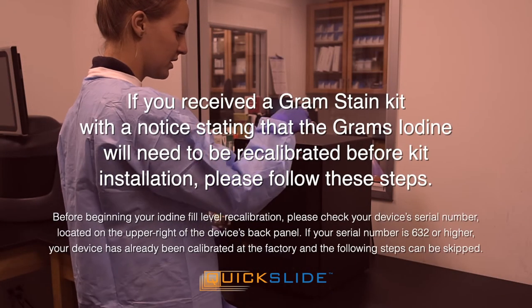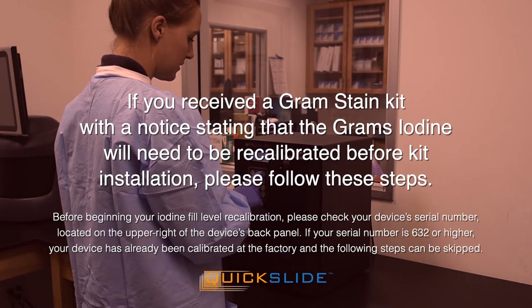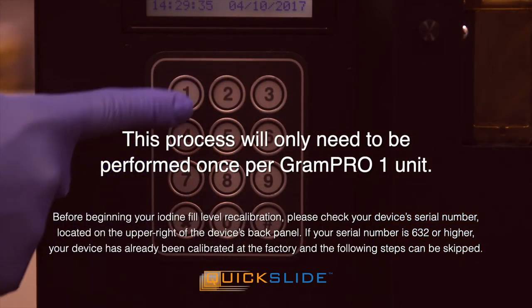If you received a gram stain kit with a notice stating that the grams iodine will need to be recalibrated before kit installation, please follow these steps. This process will only need to be performed once per Gram Pro 1 unit.